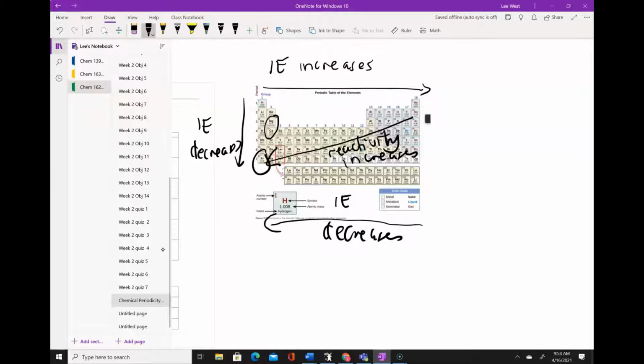We look at magnesium and calcium, and then we look at iron, copper, zinc, and then there's tin. Okay, tin. So tin is way over here. So there's some interesting things going on here. We've got different families or different locations of these metals, right? So we've got magnesium and calcium, which are in the same group. So that might give us information about how reactivity changes as we move down a group.